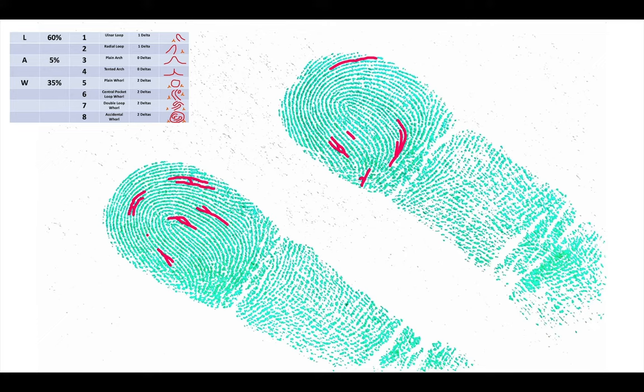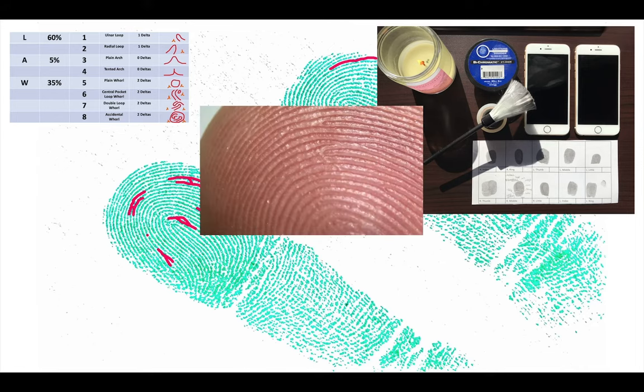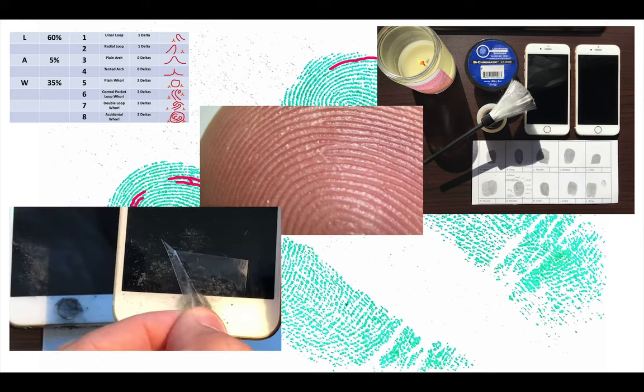We'll cover latent prints, and visible prints, and plastic prints. Under the dissecting scope, we'll get up close and personal with my sweat glands. Yes, you heard me right. I'll take 60 seconds and show you how to lift a print.